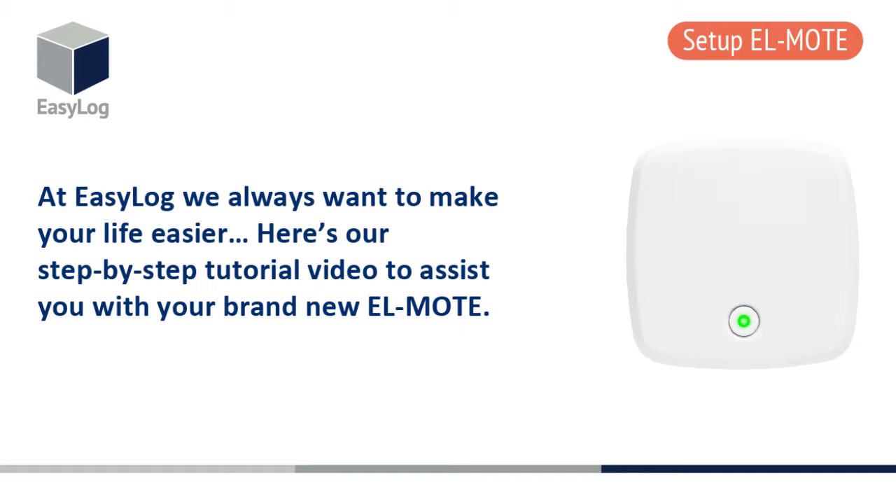At EasyLog, we always want to make your life easier. Here's our step-by-step tutorial video to assist you with your brand new EL Mote.